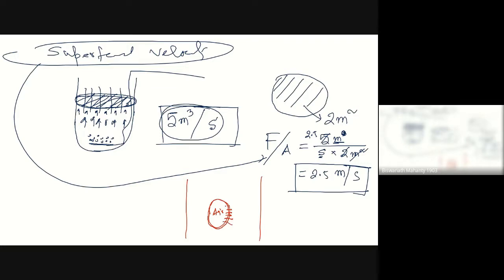So a very small amount of air from the bubble will actually come, and this is a very big resistance. It is a barrier, like an umbrella kind of thing, a skin. Of course, this skin is not like your skin, but still it has a big resistance. So from the gas phase it has to come, and then outside there is a liquid layer, right? So the molecule, for example an oxygen molecule, has to cross the liquid layer. Then it will dissolve and come inside the water phase. That means it is dissolved. Dissolved means you cannot see it, but a bubble you can see. So the bubble will slowly dissolve out.